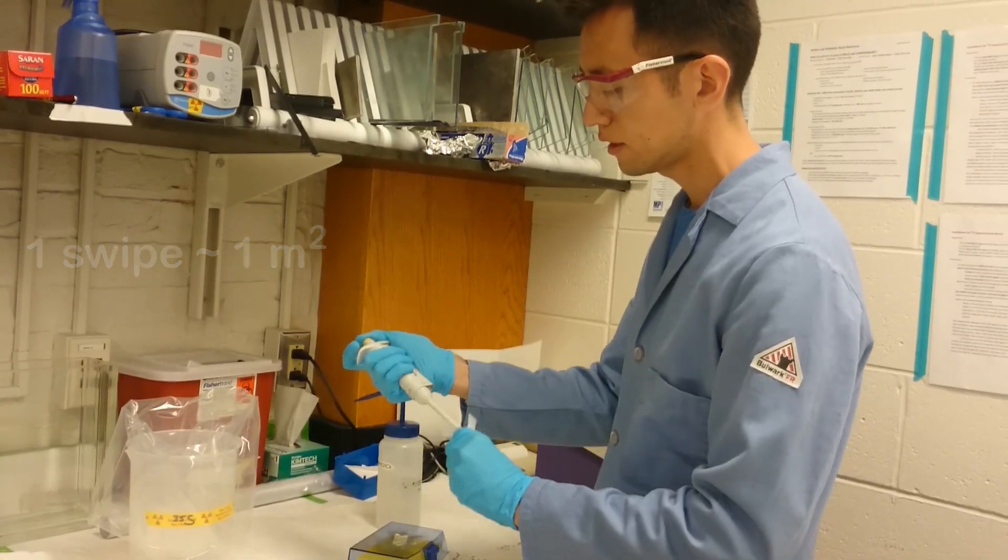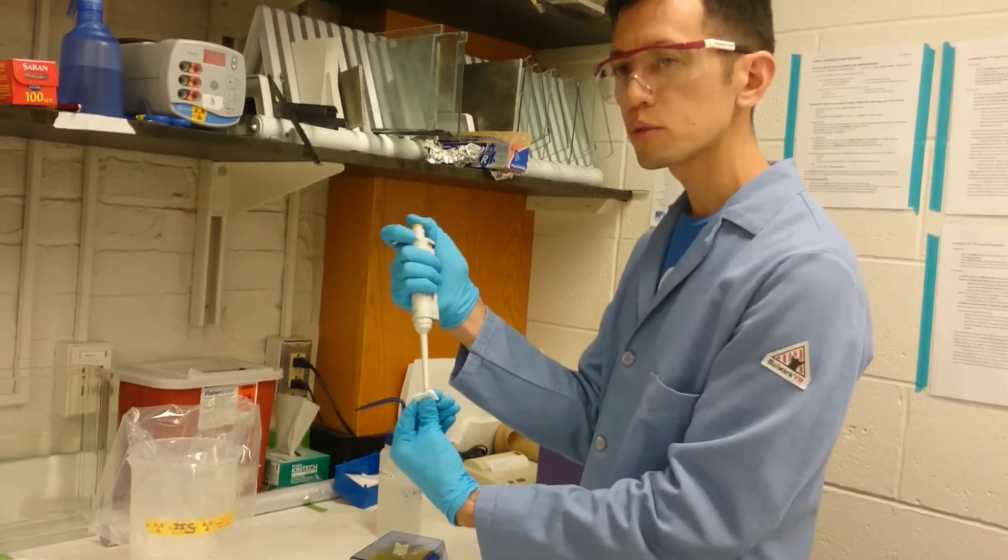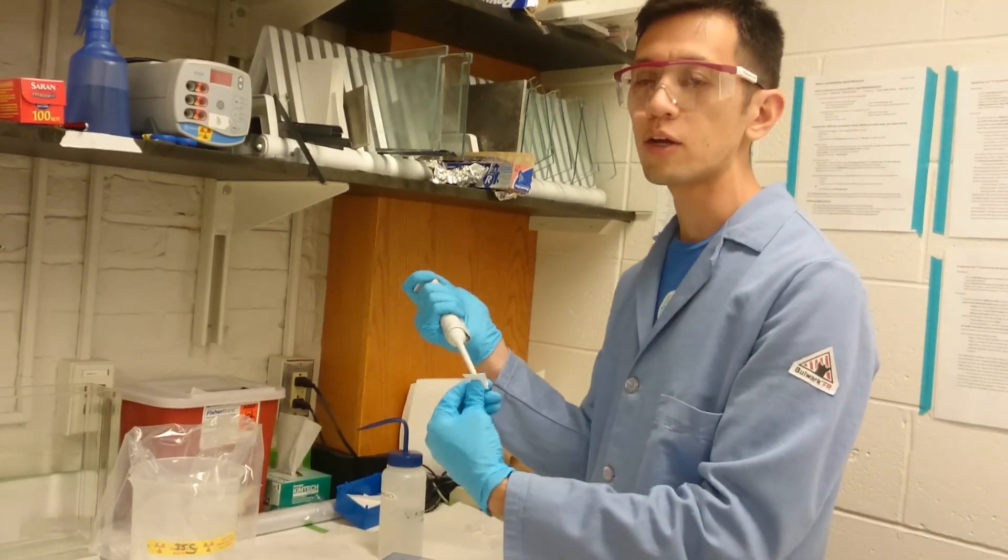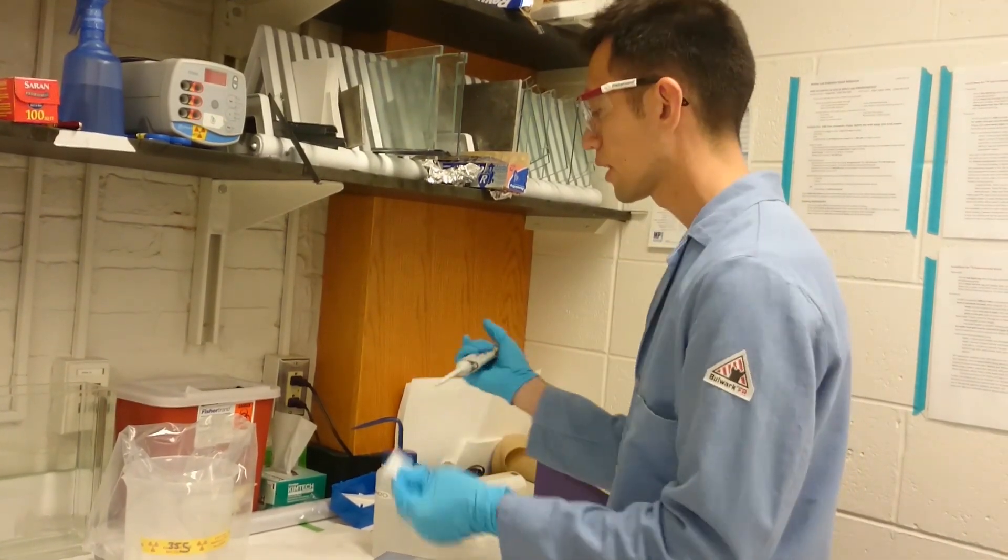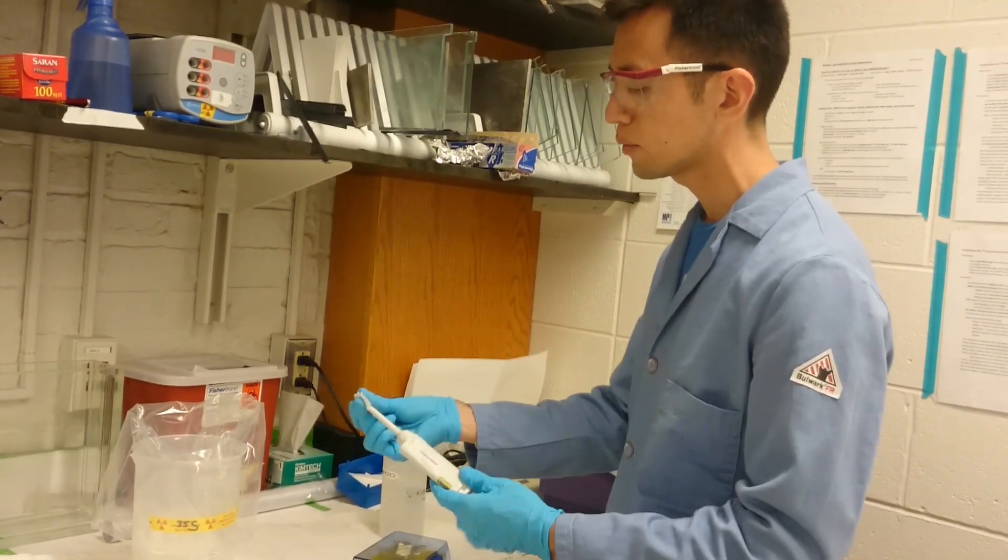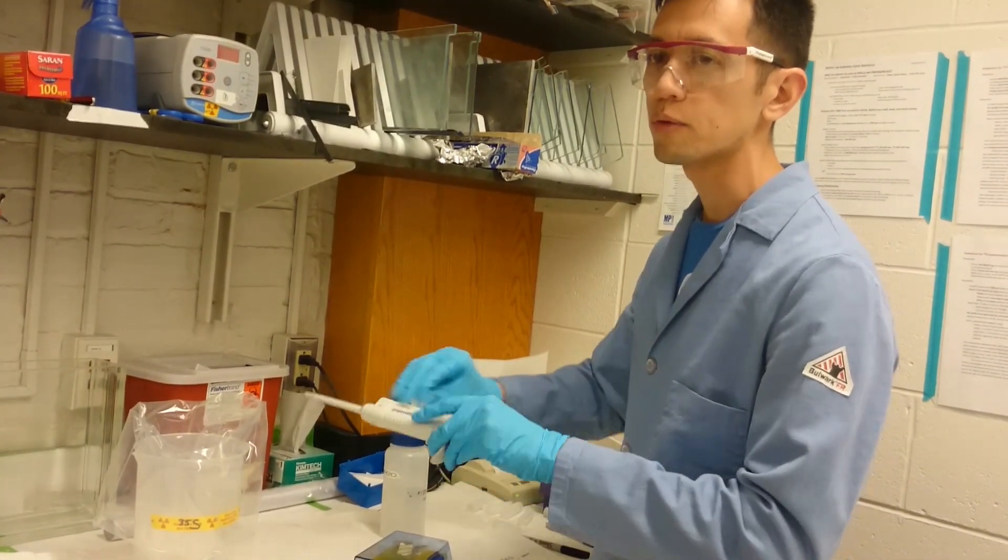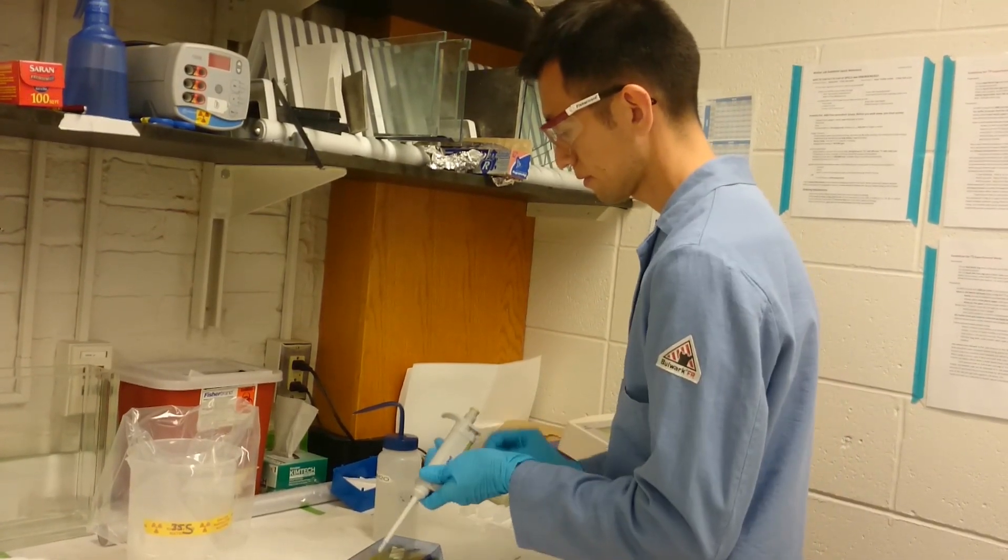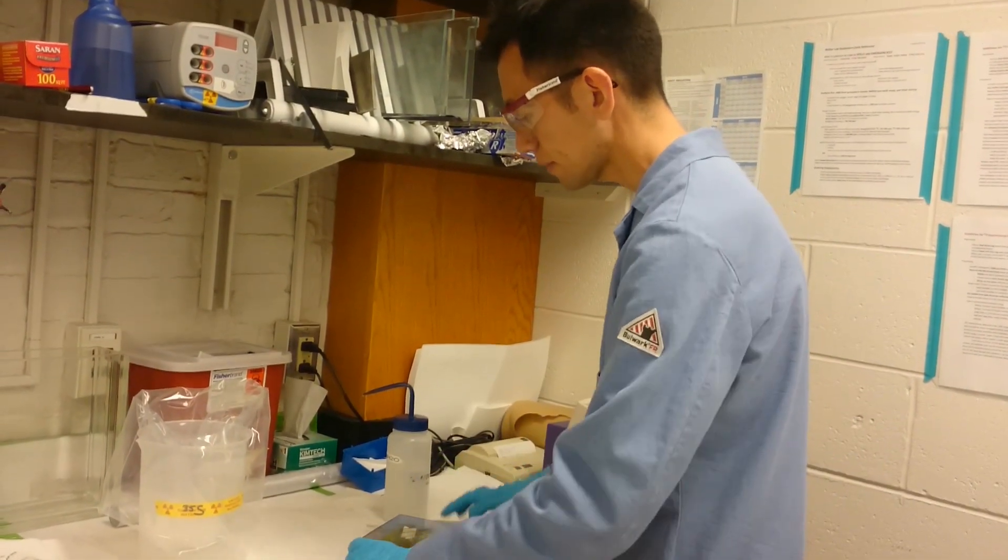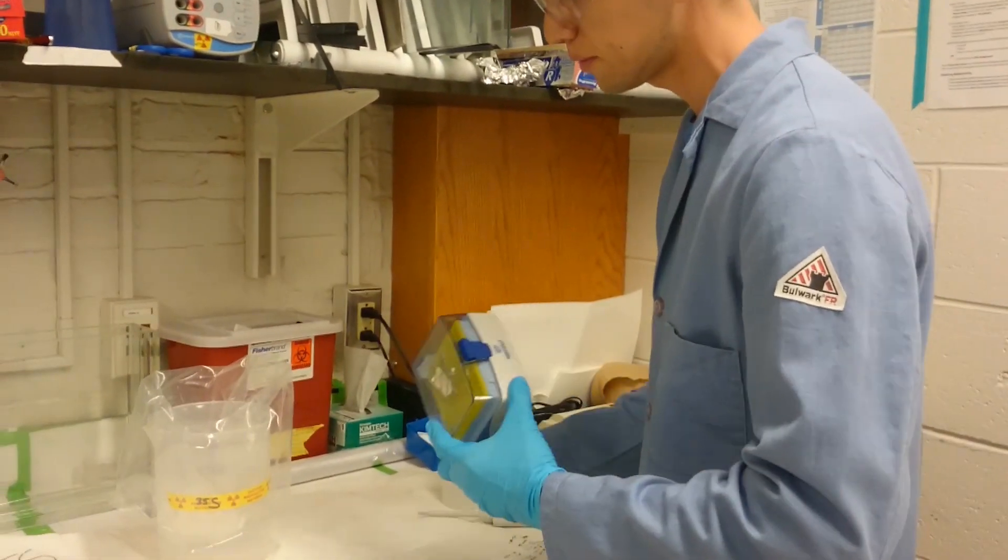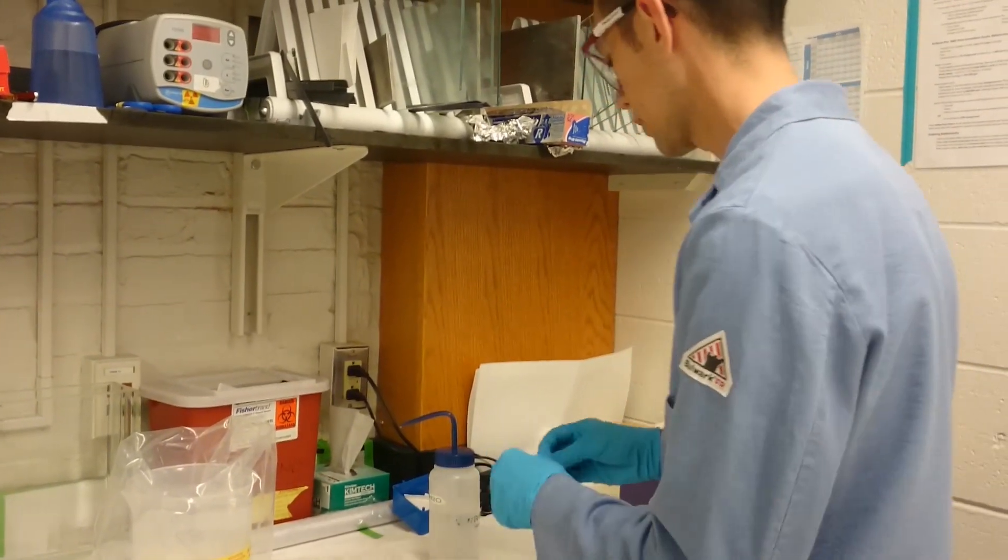It's also important to pump it up and down just in case there's anything inside the barrel. It'll get spit out onto the paper and then you'll know. So I did that onto the front side. Now I'm going to use the opposite side of the paper to swipe the rest of my pipettor. Put that down and also swipe the box - the top, the sides, and then the bottom.